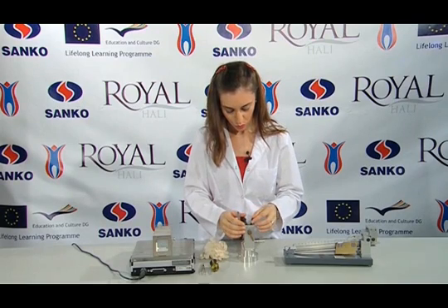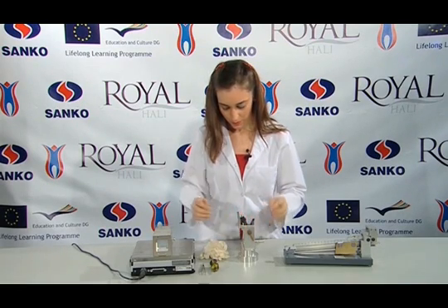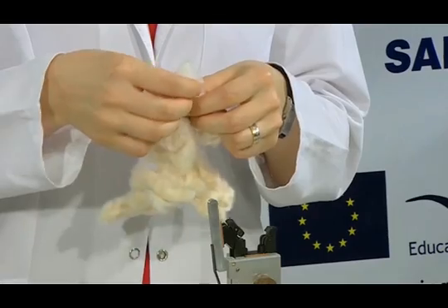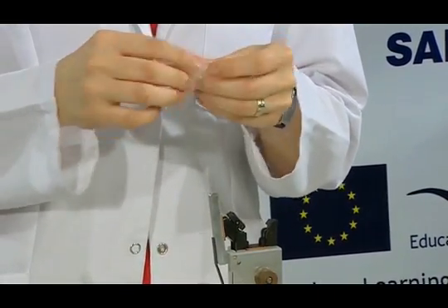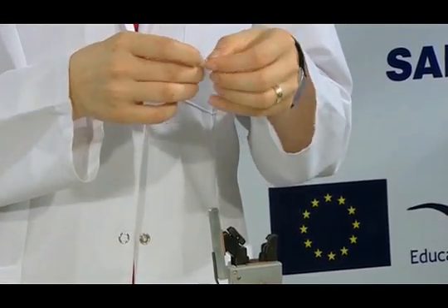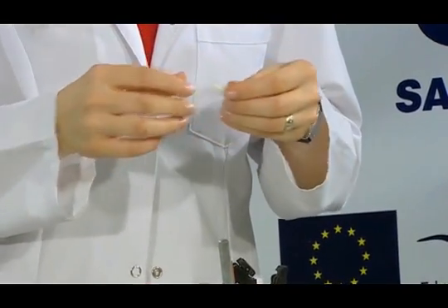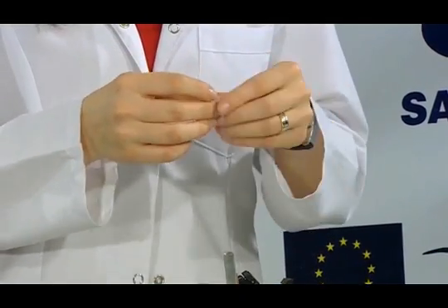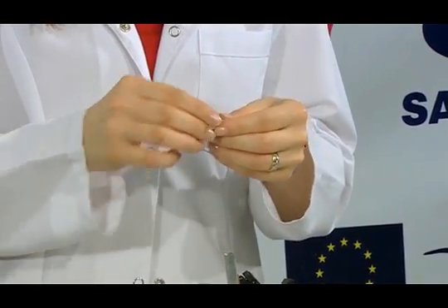Once the nippers are ready, we prepare the fibre sample to be placed into the nippers. Some fibre is taken out. We straighten it by using hands. We remove its dust. We smooth its irregularities.